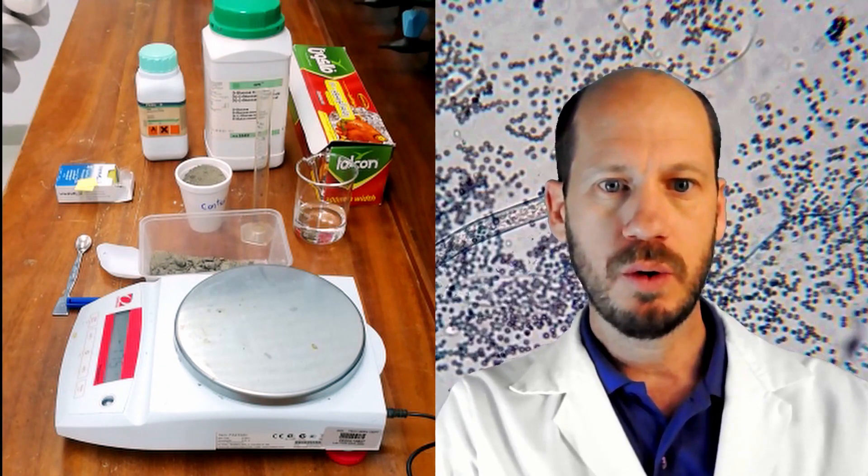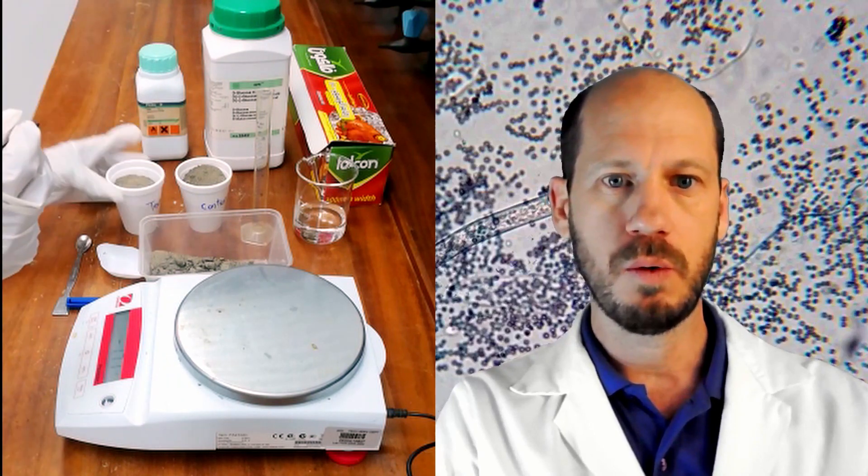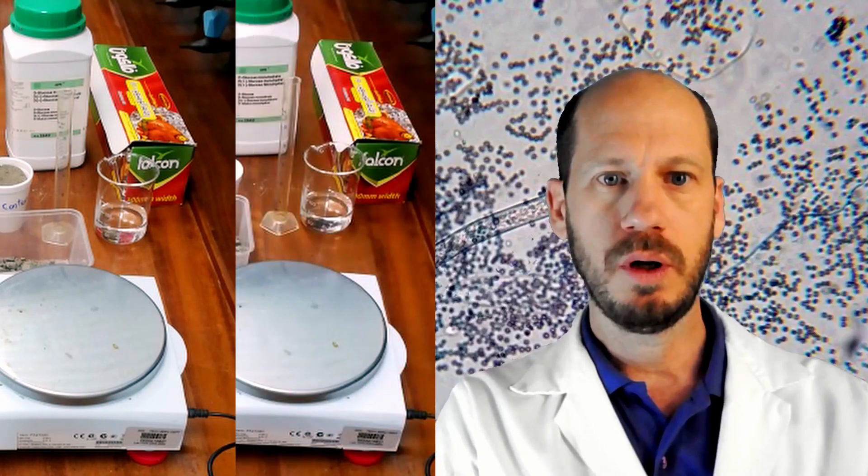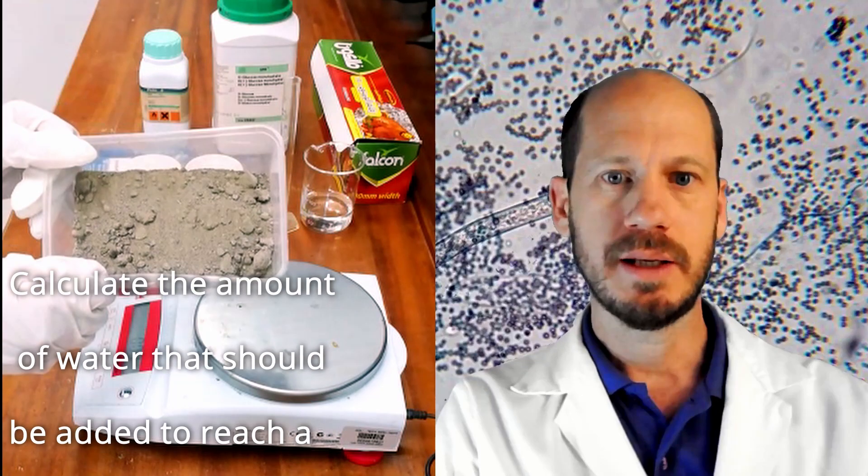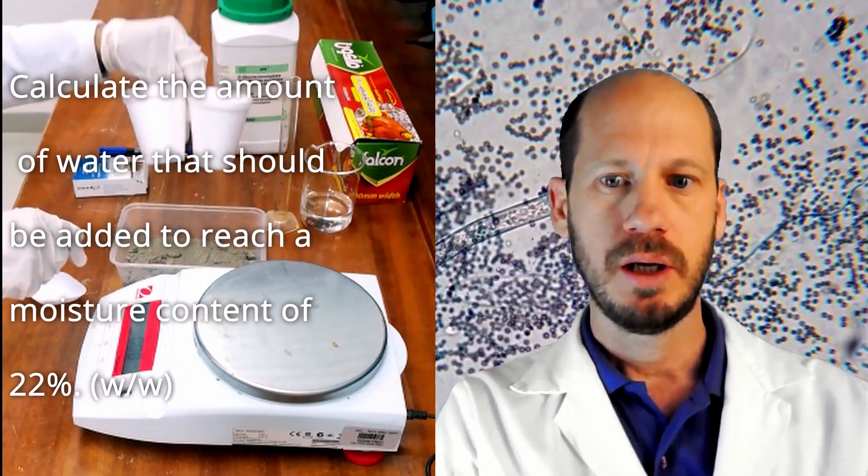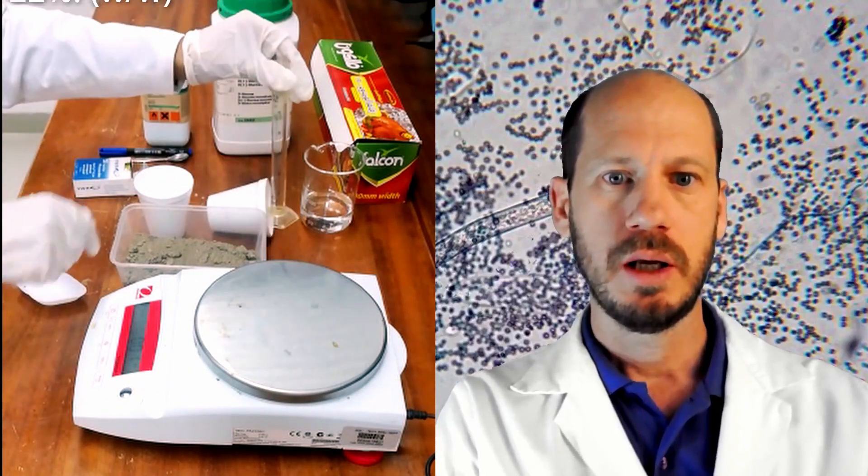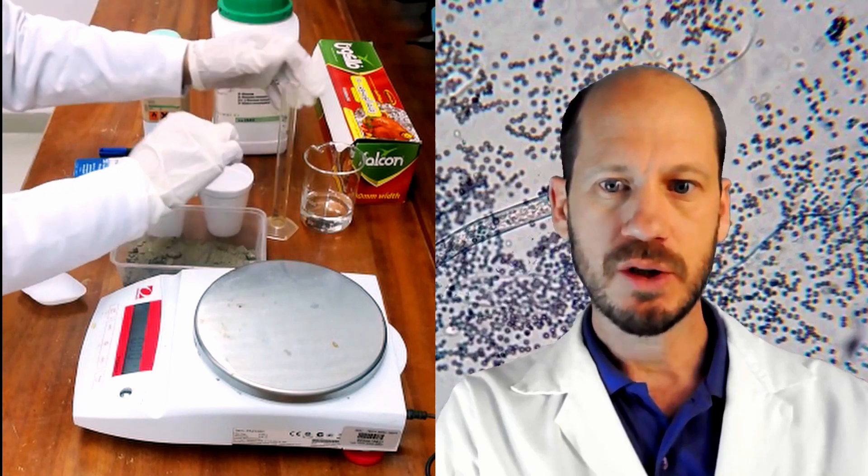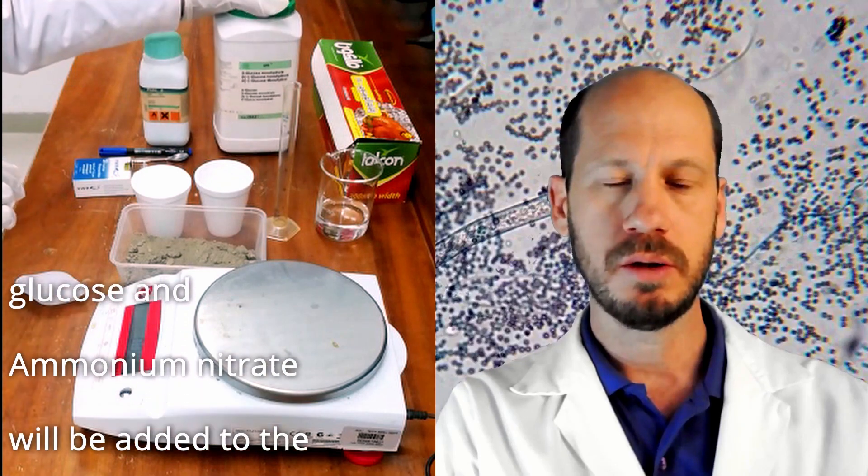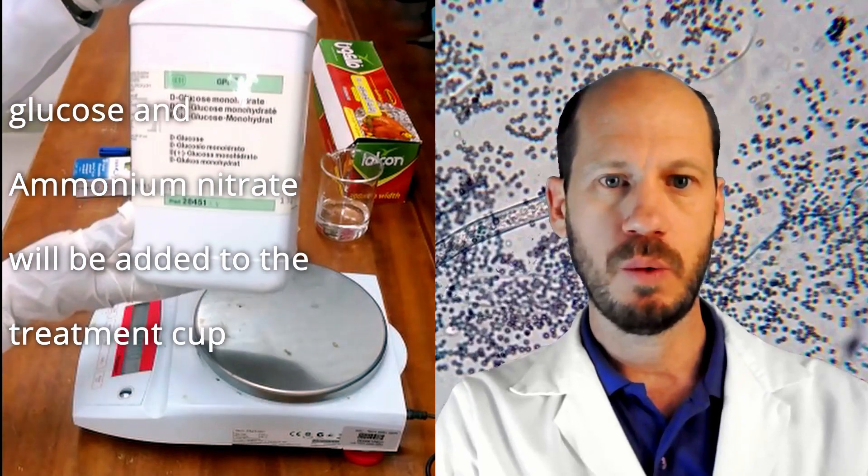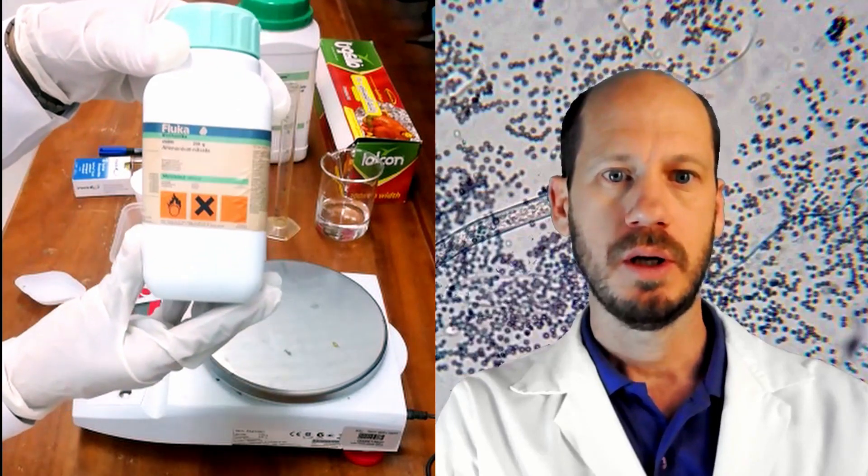What is the control and what is the treatment? The control is just the soil and water. The treatment will contain also glucose and ammonium nitrate as a source of nitrogen and carbon. Glucose is carbon and ammonium nitrate as a source of nitrogen. Both of them will receive water and the treatment will receive the water containing glucose and ammonium nitrate.